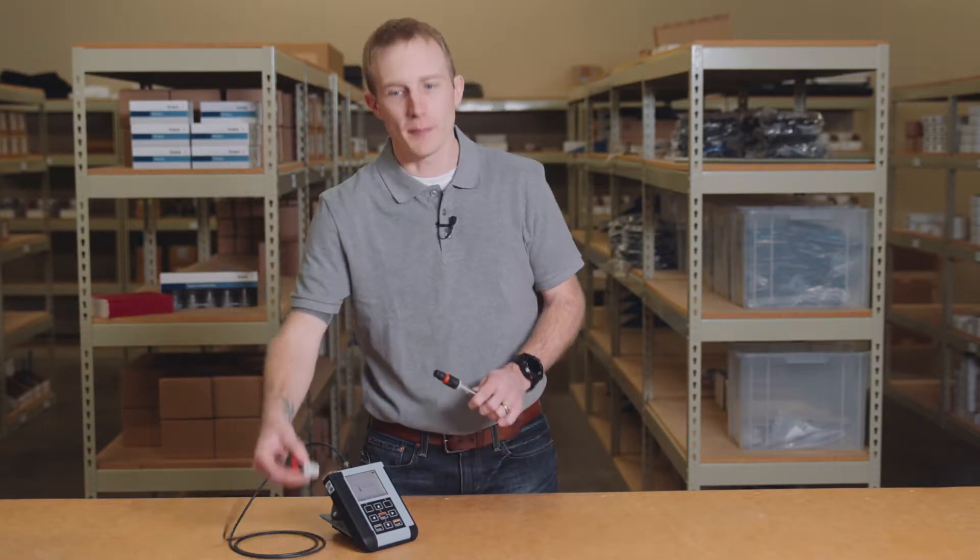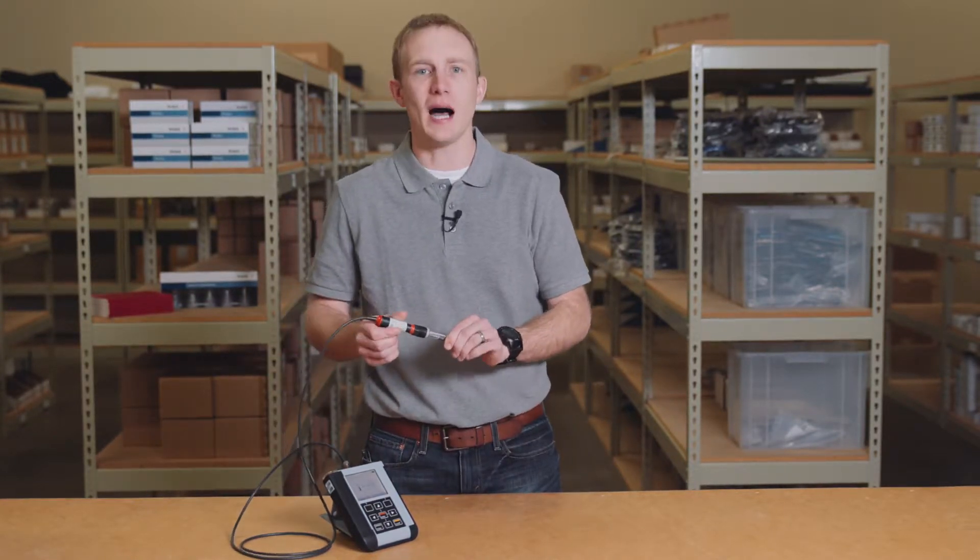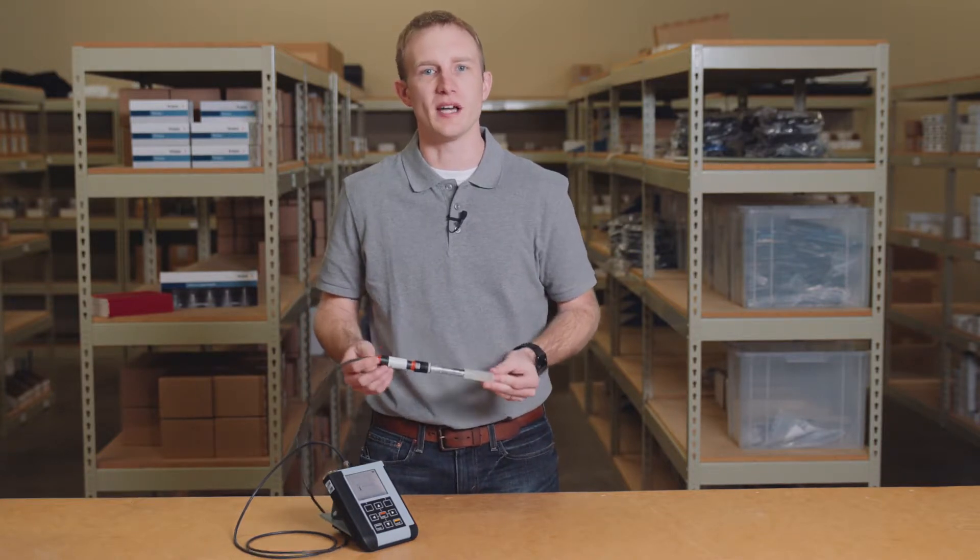Hi, I'm Tony, and today I'd like to show you some common troubleshooting tips using the Knick Portavo 907 Multi Portable Meter. The Portavo is a great diagnostics tool for in the field or in the lab use. When paired with MemoSense sensors, it provides optimal process management with intelligent diagnostics. Let's take a look at some of the key features which will easily help you to troubleshoot your sensor.